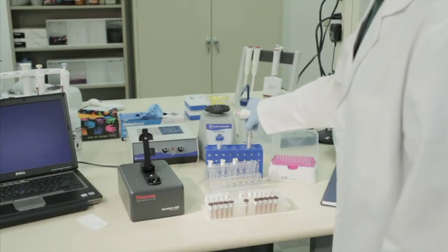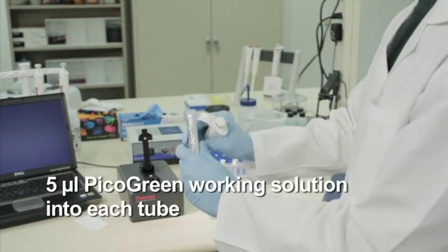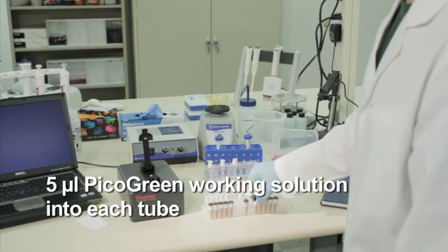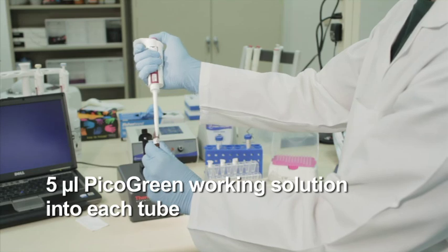After preparing the pico-green working solution according to the manufacturer's protocol, transfer an equal volume of the solution to each tube containing either double-stranded DNA standard or double-stranded DNA sample, in this case, 5 microliters.